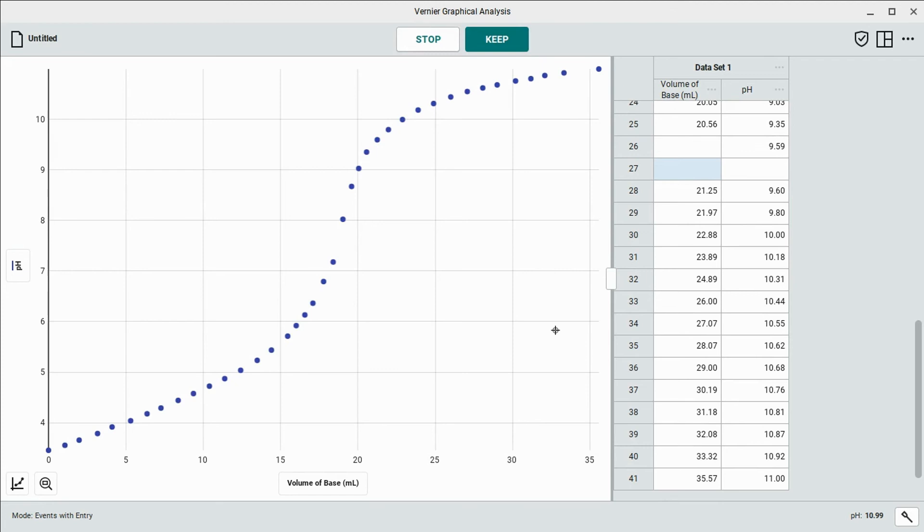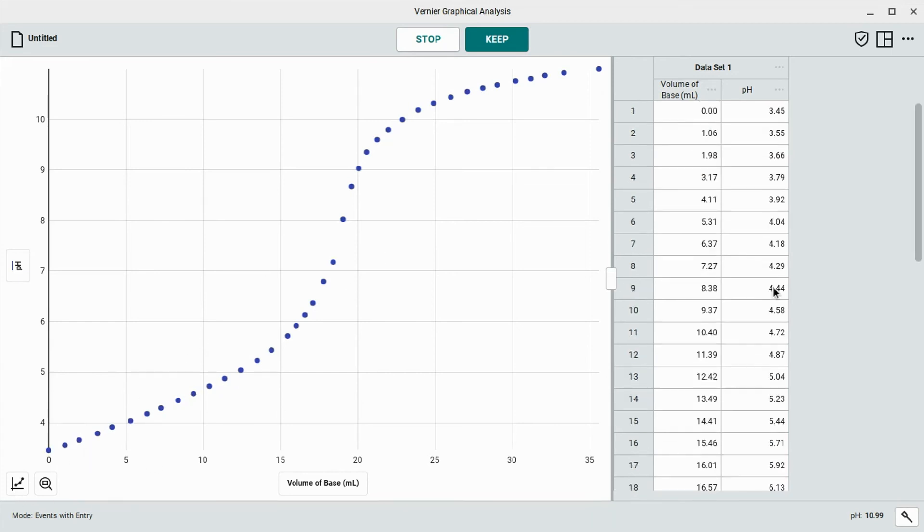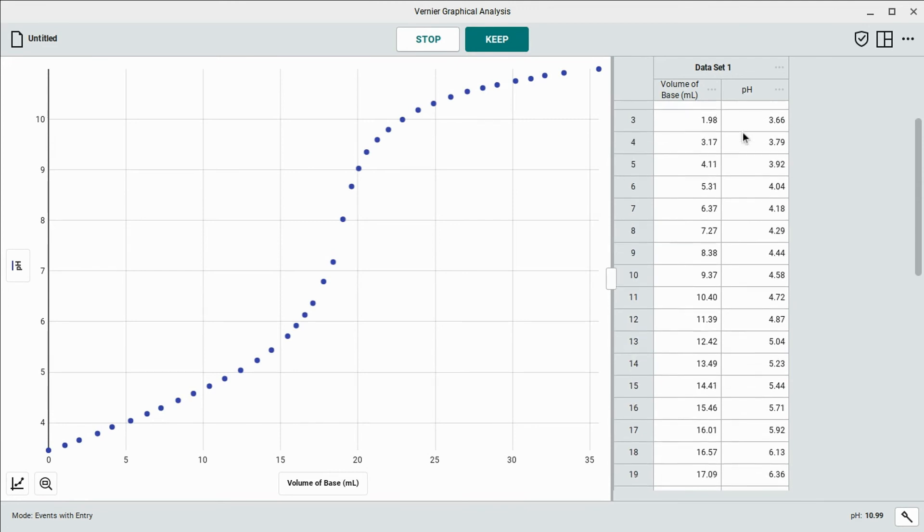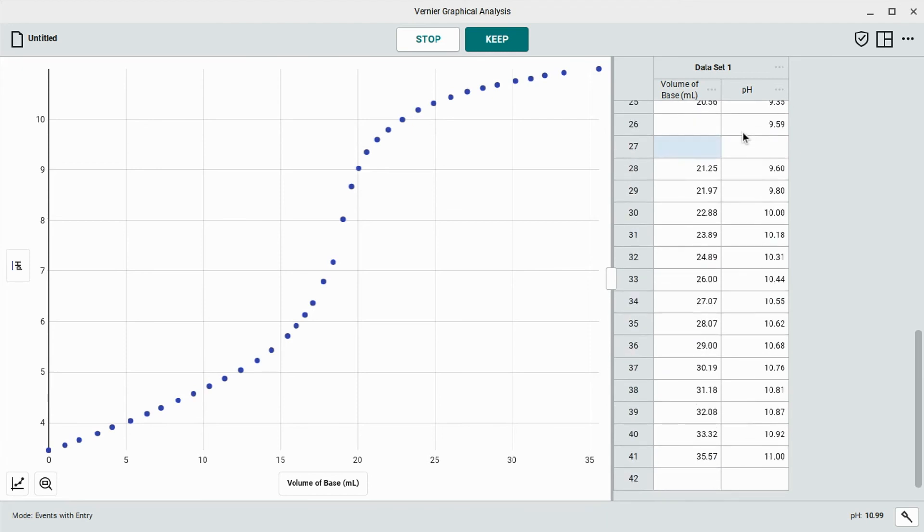And here is the data. This is the completed data, our entire curve here, all the way down from a pH of 3.45 of the initial grape juice, all the way up to 11 after adding the sodium hydroxide. So that's the data for you.